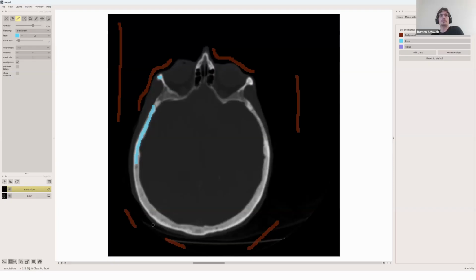Like here, we don't have much differentiation in the annotation. Like this is along the center ridge and along the boundary at the same time. And I think that should be enough. Let's take the tissue, and here we're just gonna make sure that it also knows that this outer part here, this is all also tissue.